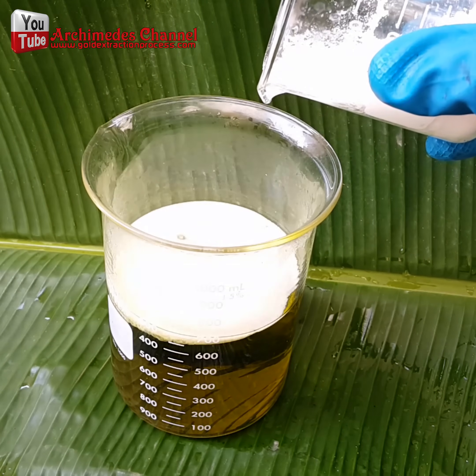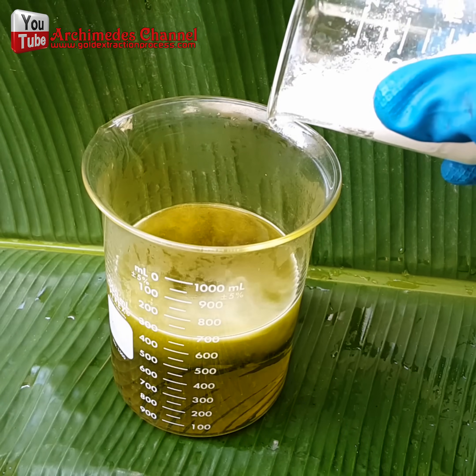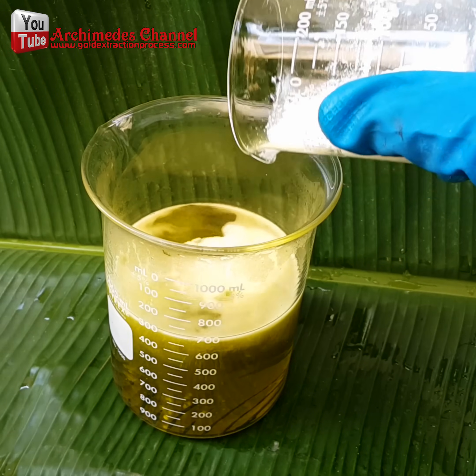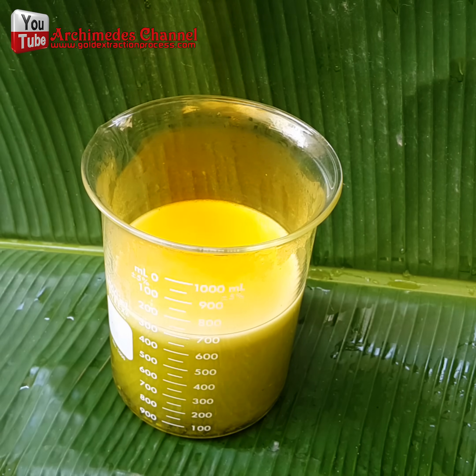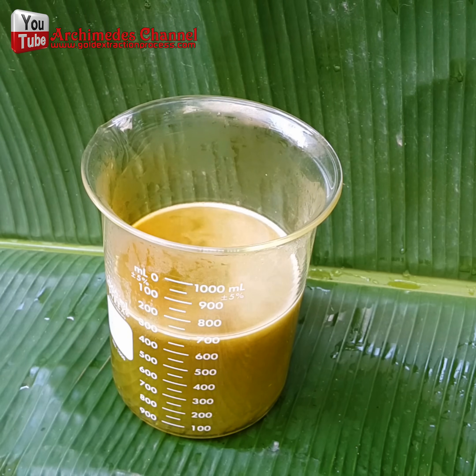Using sodium metabisulfite, I managed to get the gold to settle as sediment at the bottom of the aqua regia solution. I slowly poured in the sodium metabisulfite until reaching saturation level, or until the sodium metabisulfite stopped dissolving. At this point, the brown sediment of gold could be seen.